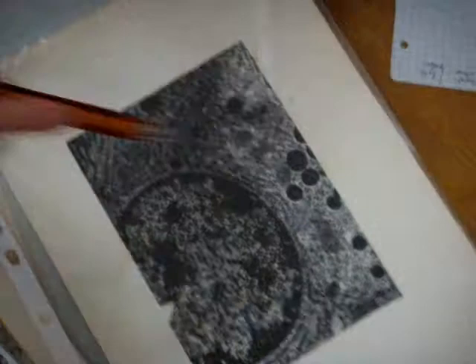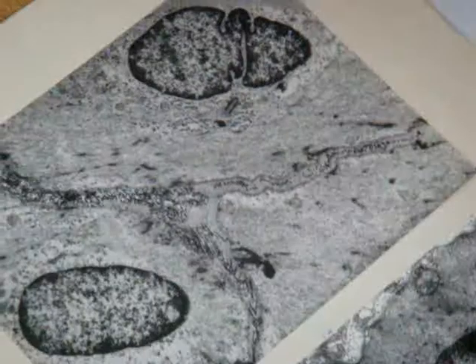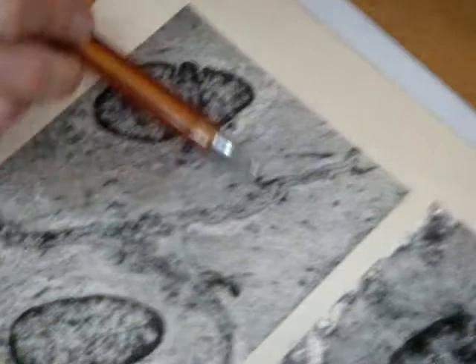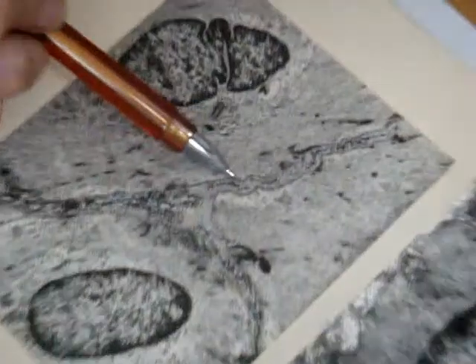What is it? Two cells, nucleus, rough endoplasmic reticulum, glandular epithelium, secretory epithelium. Again, this is the tubulovesicular type of crista, adrenal gland, cortex of the adrenal gland. Oh, what is it? Three cells. Smooth muscle, yes, we can see dense bodies and caveolae. Caveola function is what? Storage of calcium.